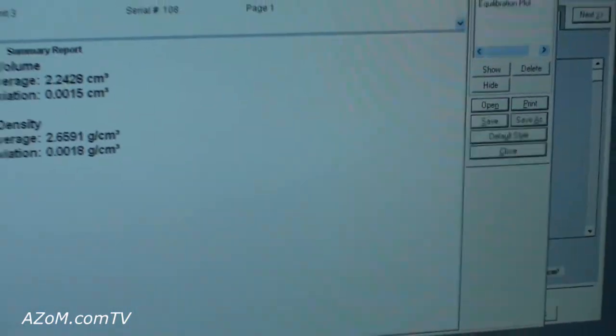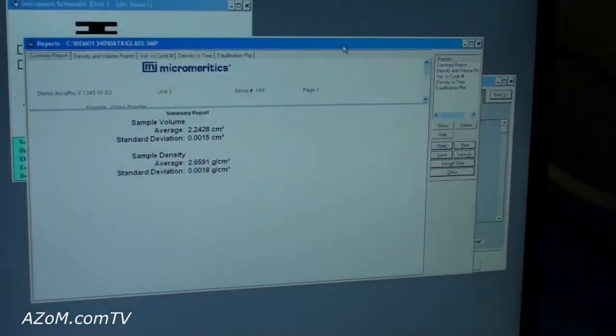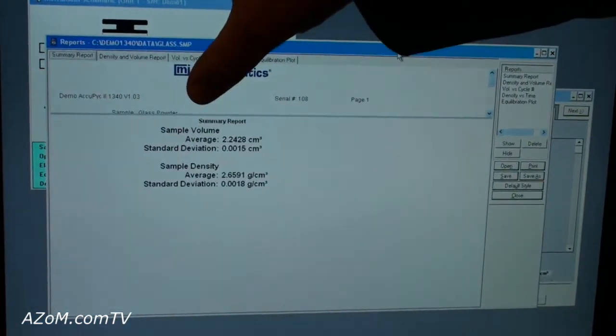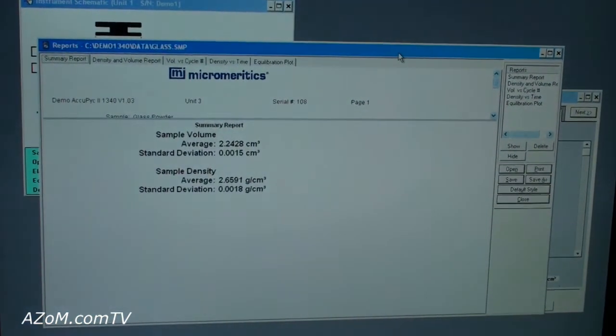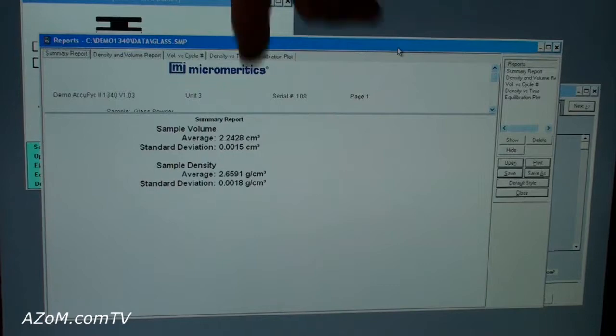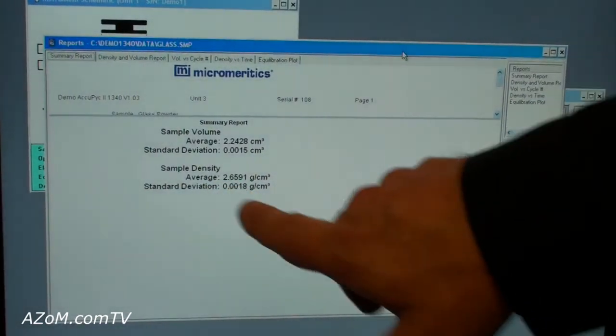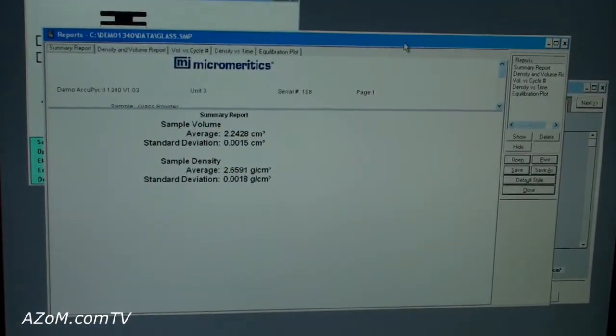In a generated result, this is what one could expect. Sample volume average from a number of tests and the standard deviation and the sample density average and standard deviation from a number of tests.